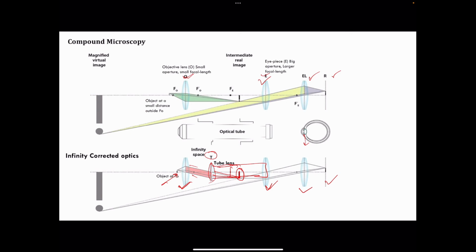How do we get rid of this problem? Because you cannot compromise by not using these polarizers and specific filters. You have to use them, but you have to use them such that your optical train and arrangement of the optical elements is unhampered. Now how do you do that? In the infinity space where the rays of light are parallel, if you keep any optical element in this arrangement of the parallel beam of light, it will not affect your optical train of the microscope, as a result of which your image will still be formed as depicted in the above illustration.